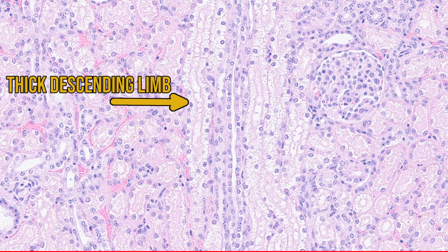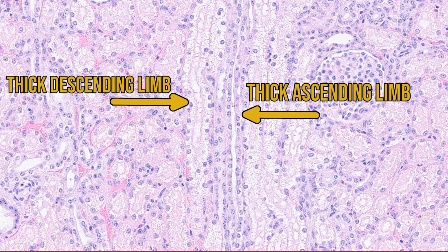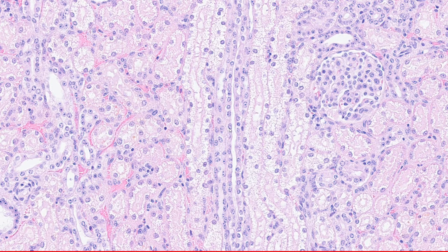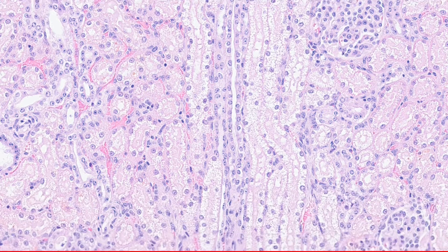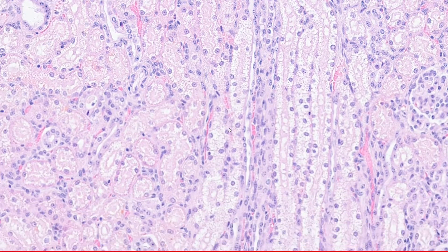Similarly, right next to this thick descending limb we have a thick ascending limb, which looks very similar histologically to the distal convoluted tubules, such as this one over here. So let's head a bit deeper down into the medulla and see which other tubules we can find.